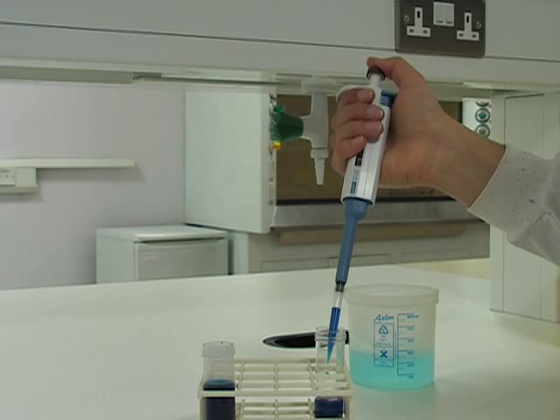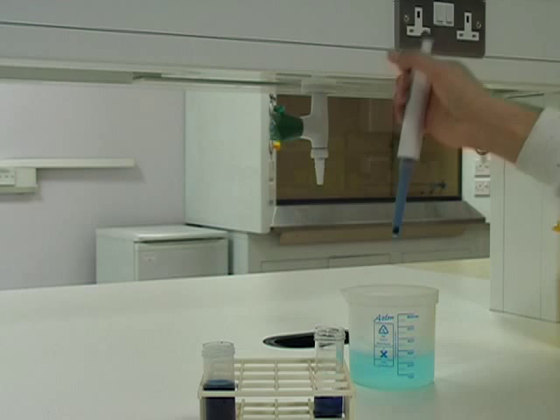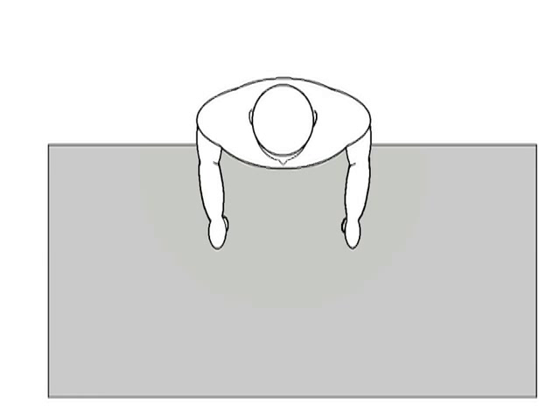Pipetting for a period of time can become strenuous. To help reduce this stress, organize your work area by moving regularly used items such as tips and tubes closer to your body and less frequently used items away from this comfortable working zone.